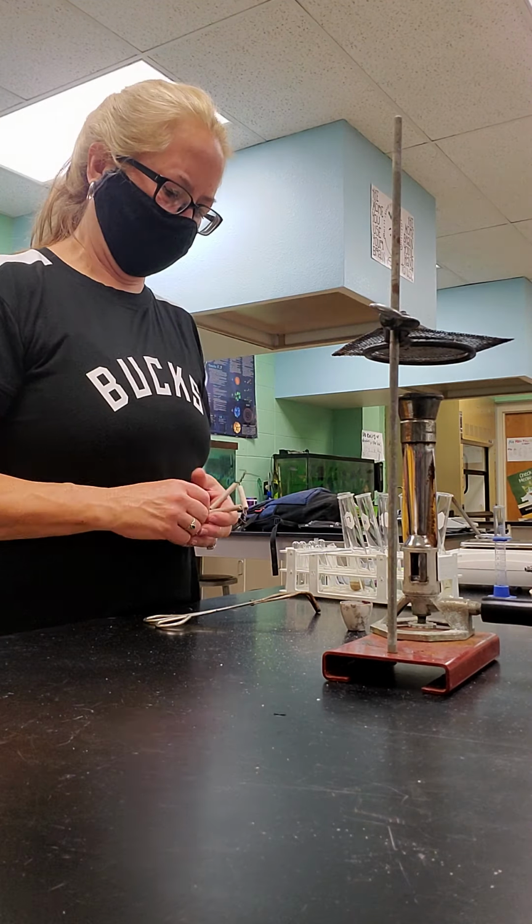All right, now we're down to sodium hydrogen carbonate, Will. Okay, so I've got some sodium hydrogen carbonate. Put that in the test tube. Okay, you make it kind of like a boat and pour it. Okay, show them over here. Hold it. Okay, now I'm going to add to it some hydrochloric acid. Okay. Here we go.